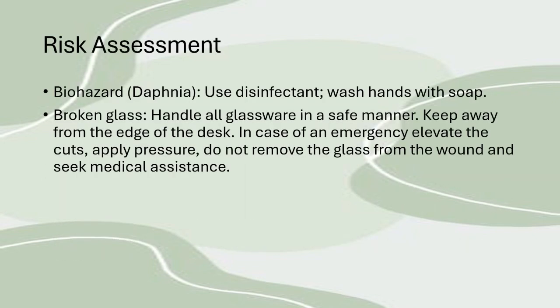Risk assessment. There are two risk assessments to look out for, and one of them is the biohazard, which is the Daphnia itself. It is a living organism, so hence it would be a biohazard. To minimize risk, use disinfectant when handling Daphnia and wash your hands with soap before and after the practical.